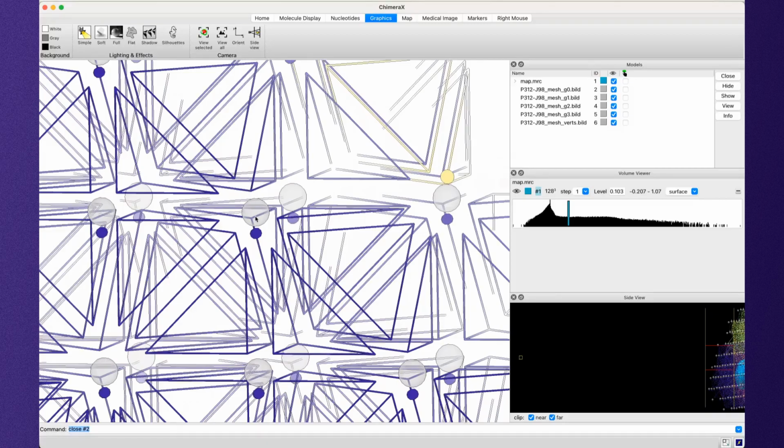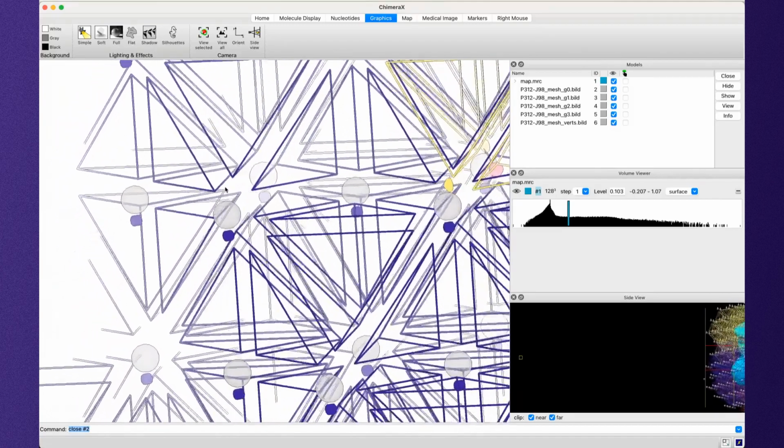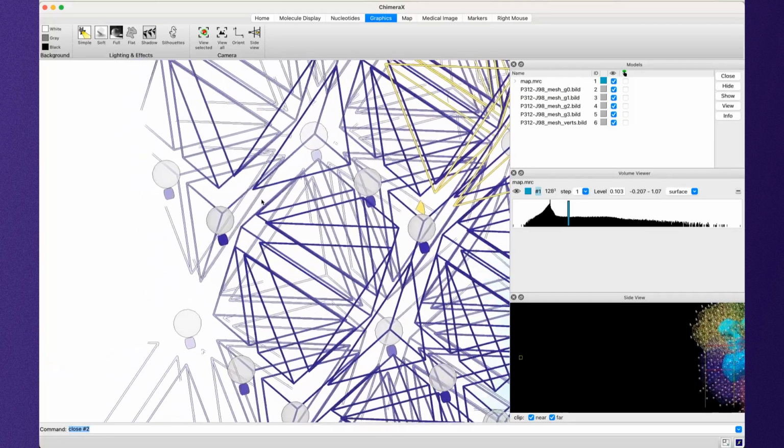So when we model deformation, what we're modeling is the movement of one of these vertices in some direction. And so what that means is that if we were to say move this vertex and this vertex closer together. Let's say we move just this vertex to the right. This tetrahedral cell would shrink in this way. And so all of the density contained inside this tetrahedron, which is none in this case, would be compressed along this axis. But the important thing to remember is that this tetrahedral cell, the one below the one I was just pointing at, also uses this vertex. And so it would also be compressed, right?